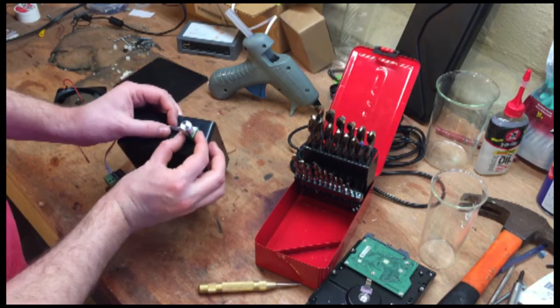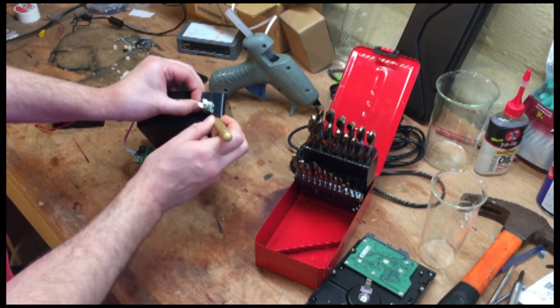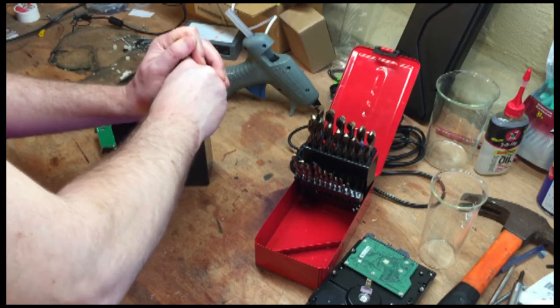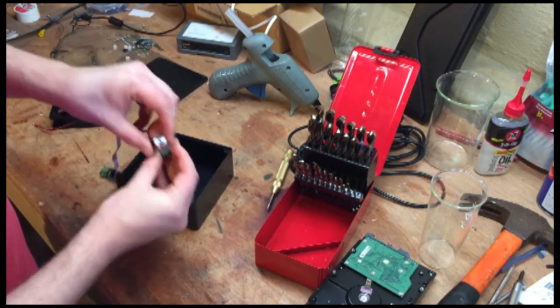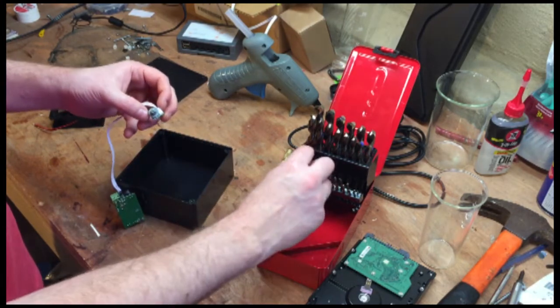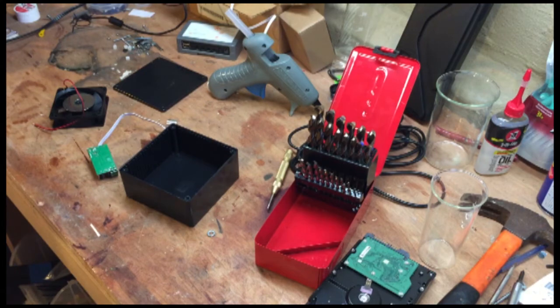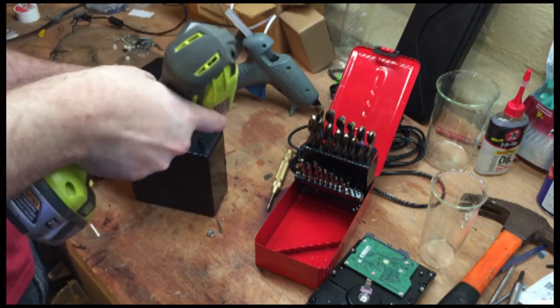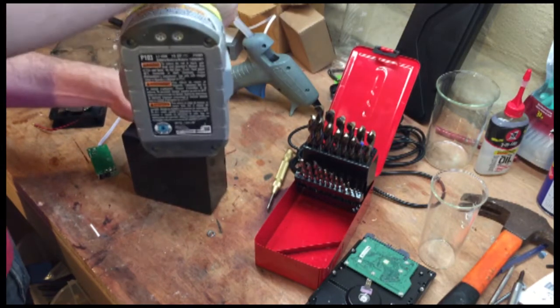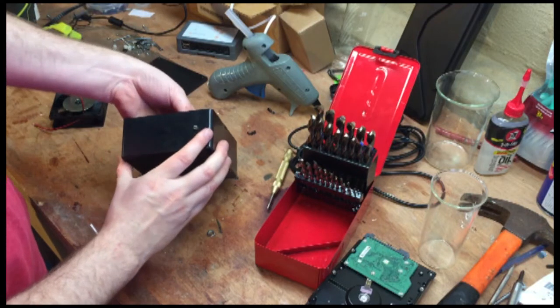Alright, so your next step is going to be to place the speed control on the box. And I'm going to place it right about there. And so I'll just take my marker and then take a drill bit. This knob will just pull off, or if you have a slightly different one, it might have a set screw. And there'll be a keeper nut below it. And pick a drill bit that's about the right size. There we go. And drill the hole. Should just slide in. Yep.